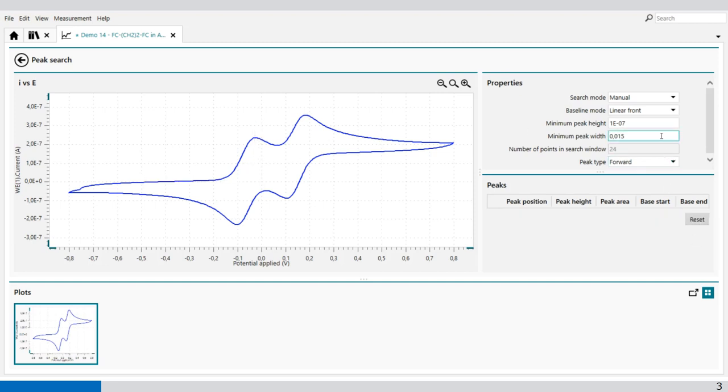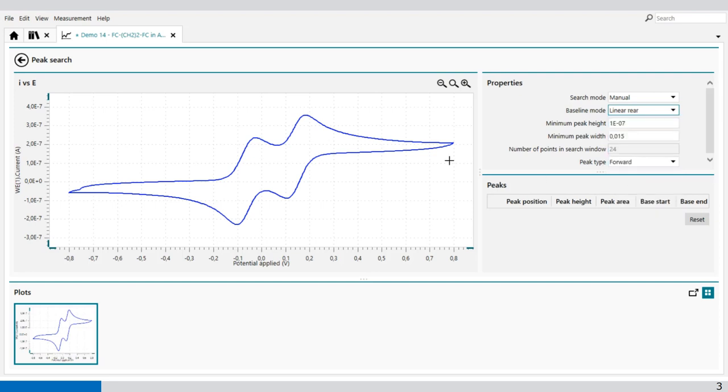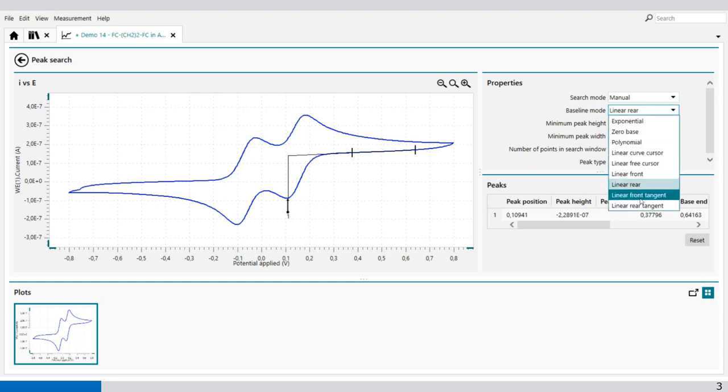The same we can do for the rear, like this. And it gives you the peak of the rear. The other two are just different calculations of the front and the rear. There's tangent and rear tangent, but it works the same way.